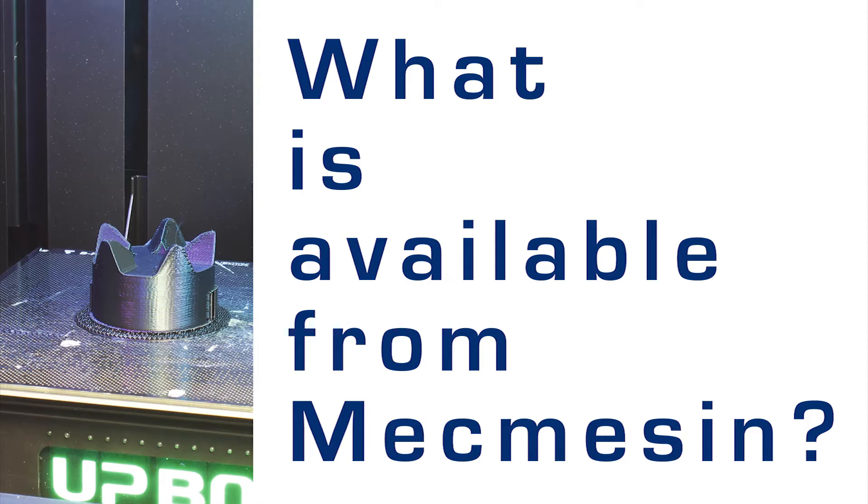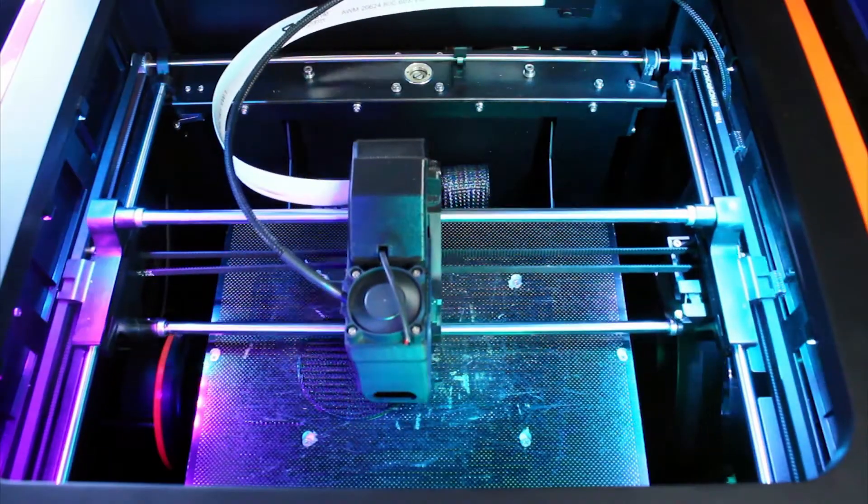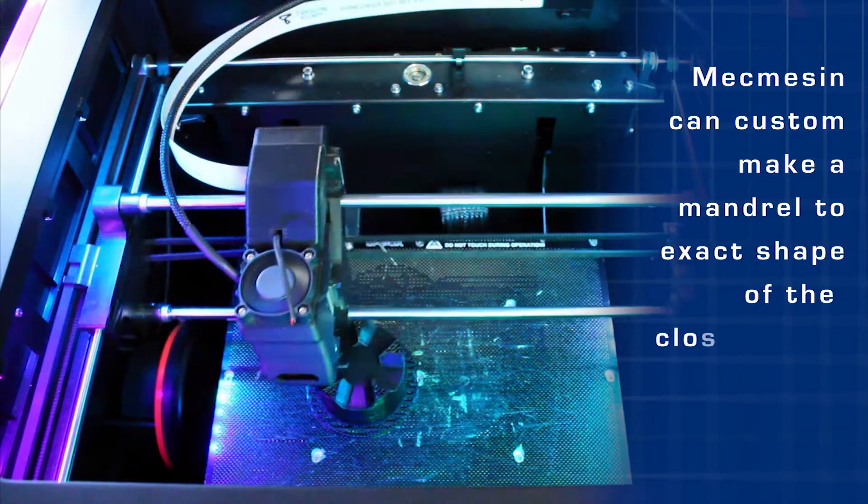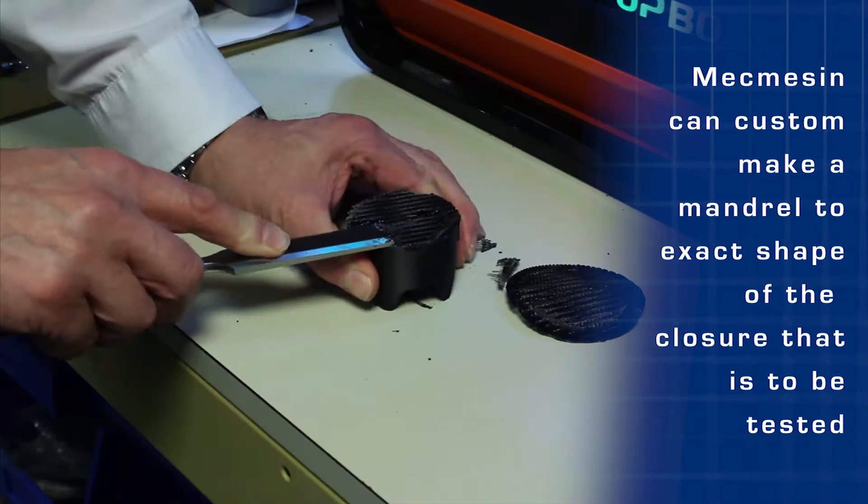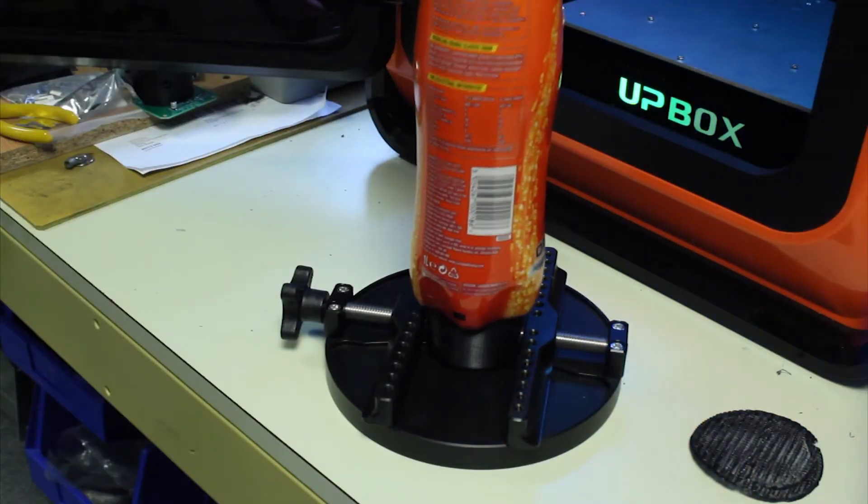So, what's available from MacMesson? We can custom make a mandrel to the exact shape of the closure that you need to test.